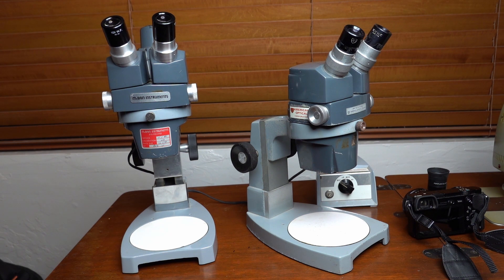If you get one with a dedicated video port — which would be a third port coming out the top — they get quite pricey. And people want to take video through their dissecting microscope, so I'm just going to show how I get video through these microscopes.